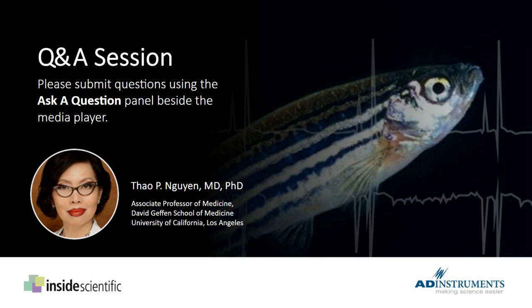Because relatively speaking, in normal, healthy human adults, the atria are much smaller as compared to the ventricles. That's why in abnormal atriomyopathies in humans, when the atria are really enlarged, what do you see? You see enlarged P waves on EKG, either right atrial enlargement or left atrial enlargement.